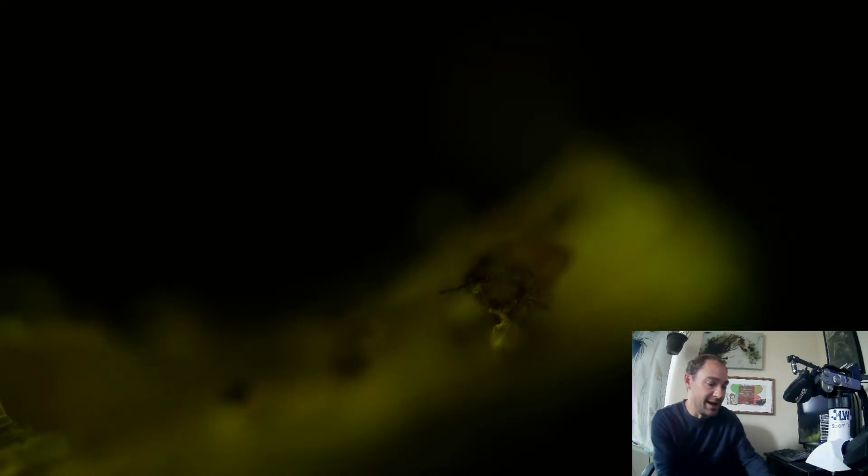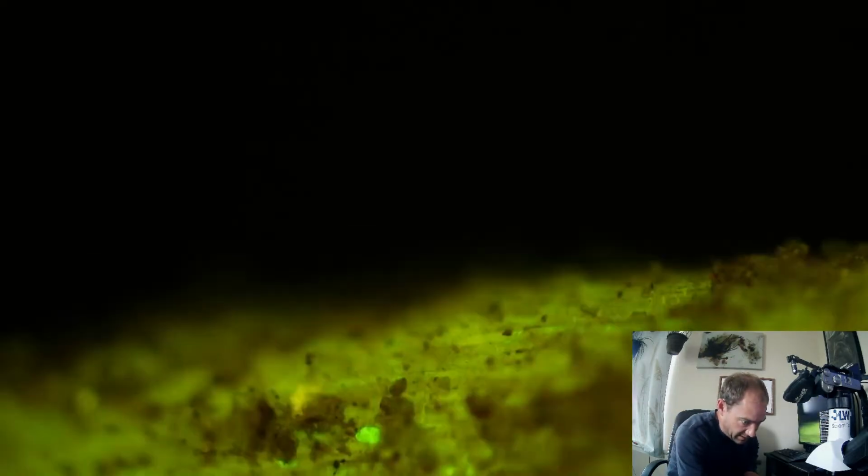All right, let's grab the next slide for the next 3 roots. Pull that out. And it's actually right here. All right, are they still laid out in the right place? No wind blowing them? All right. Let's get over onto the first one that we're going to look at, which is raspberry. Let's actually get way over here on this end.